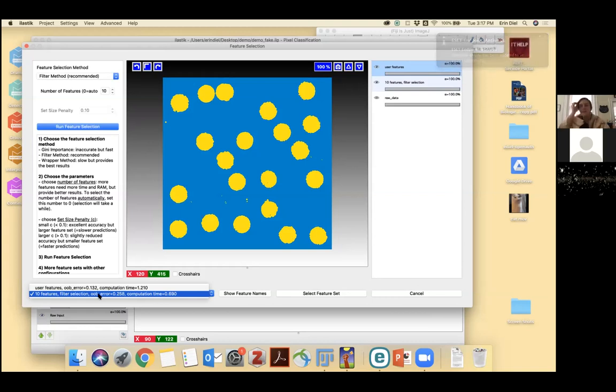And how do I tell if it's doing a good job? What's a number that I can say, okay, it's doing this well? This out-of-bag error is one example of a number that you could provide to say how poorly or how well the model is doing. But it does require that you put in a decent amount of training data.